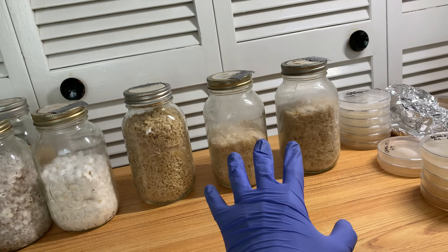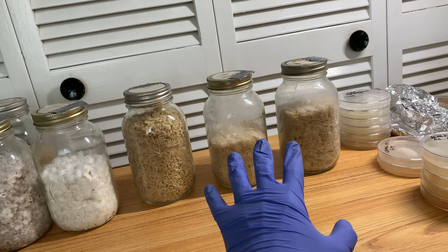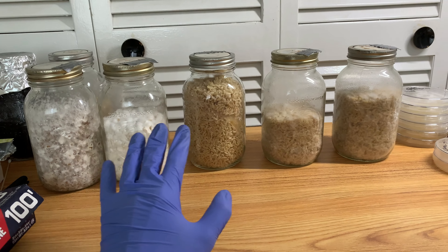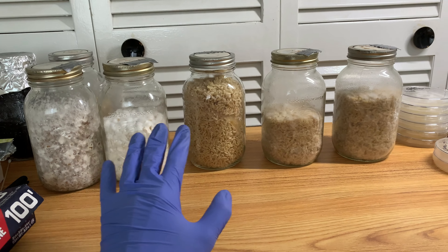In my case it was long-term storage leading to a moth infestation that made the rye dirty. But you can't say it's just because it's rye or because you use popcorn — what matters is the batch itself. I actually started this channel because I had a two-year-old jar of rye grains I hadn't inoculated. I found it and thought it'd make an interesting experiment, and it had no problem colonizing — completely beautiful. Two years in storage with just micropore tape in a kitchen cupboard through all sorts of temperature swings, no problem. But this particular batch of rye, sterilized way more, still had tons of issues.